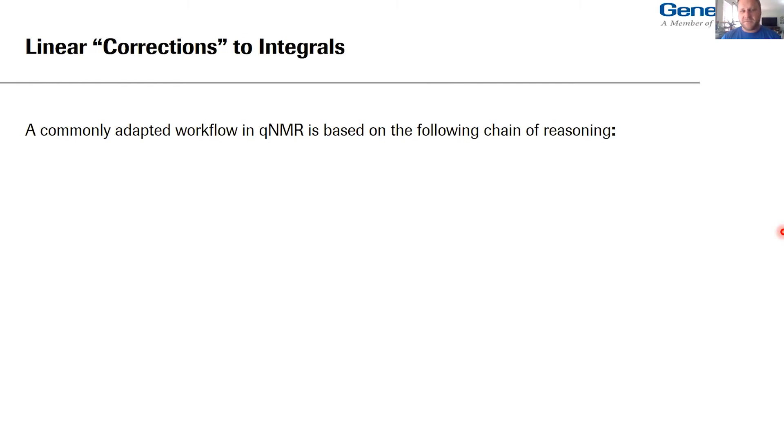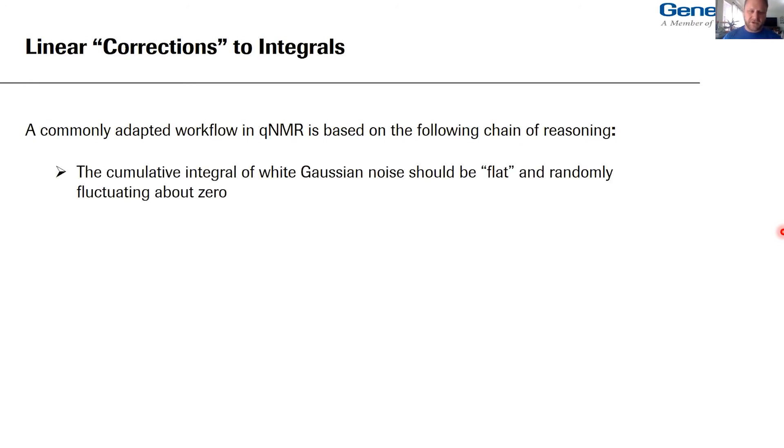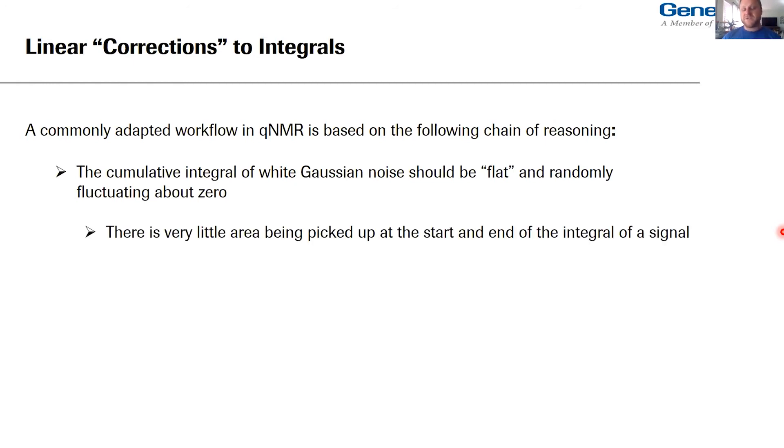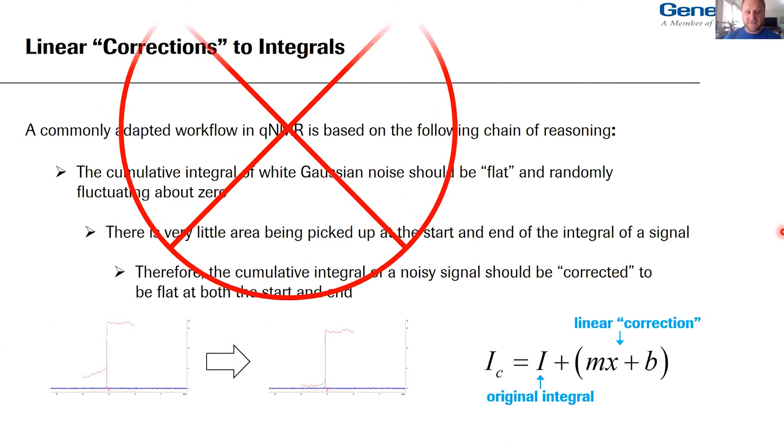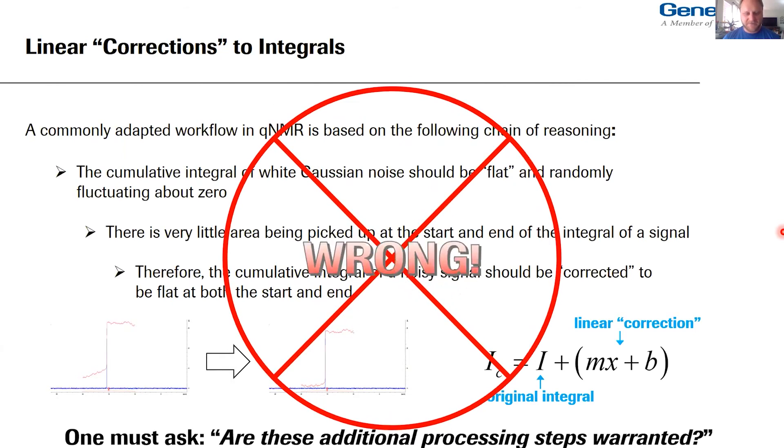Switching gears: knowing what we know about noise integration and the Wiener process, let's talk about linear corrections to integrals — and you'll always see 'corrections' in quotation marks. A commonly adapted workflow in qNMR is based on the following chain of reasoning: the cumulative integral of white Gaussian noise should be flat and randomly fluctuating about zero; there is very little area being picked up at the start and end of the integral of a signal; therefore the cumulative integral of a noisy signal should be corrected to be flat at both the start and end. And that's simply wrong.